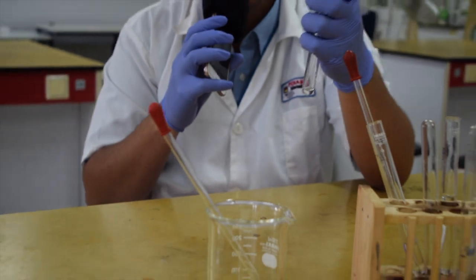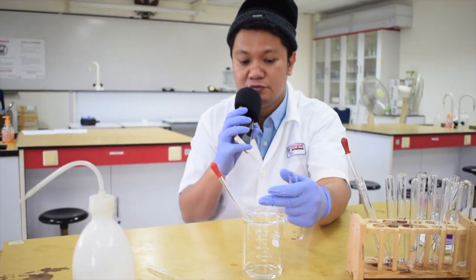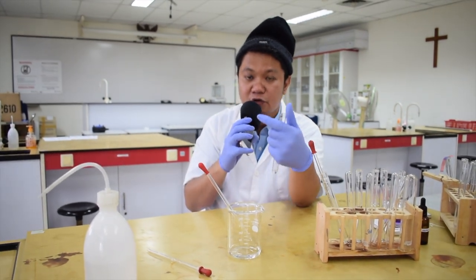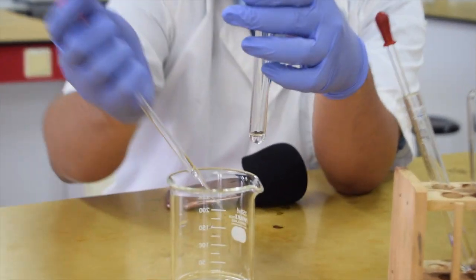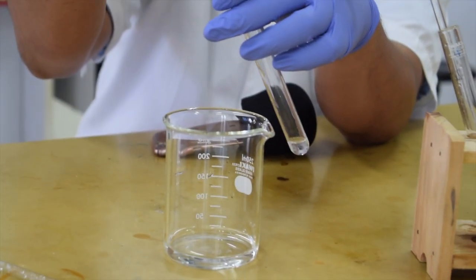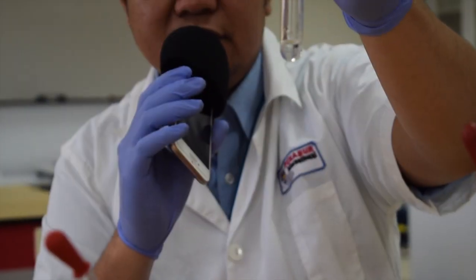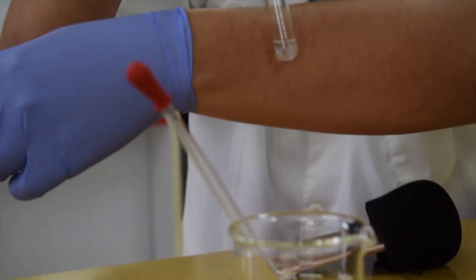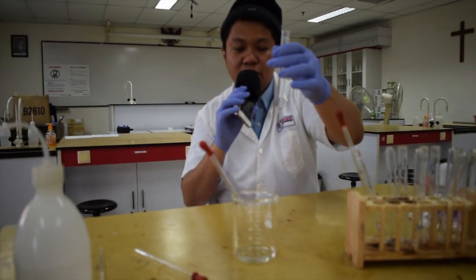I want to detect Zn²⁺ with sodium hydroxide (NaOH), because zinc 2 plus reacts with sodium hydroxide. The basic agreement is: you put the reagent 2 or 3 drops first — do not shake — then just observe. A white precipitate starts to form. After observing the initial precipitate, you add excess reagent. How much is excess? If I use one centimeter depth of sample, I should use twice or double the volume of the initial sample.